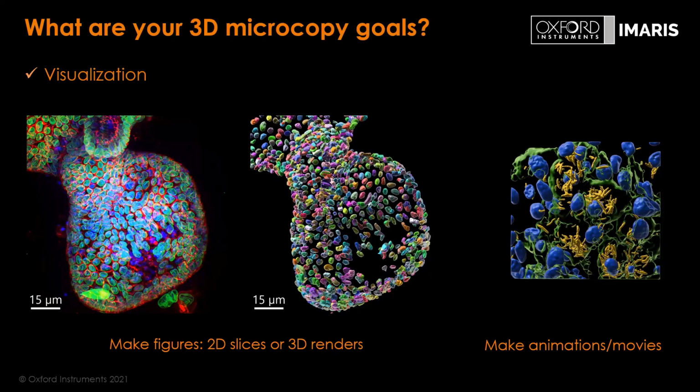In terms of visualization, you have the possibilities of doing 2D, 3D, maximum intensity projection, all those things, or even make animations and movies where, in a presentation, you can zoom in through your data set and fly through different objects and those kinds of things.